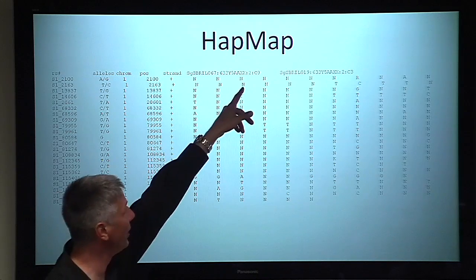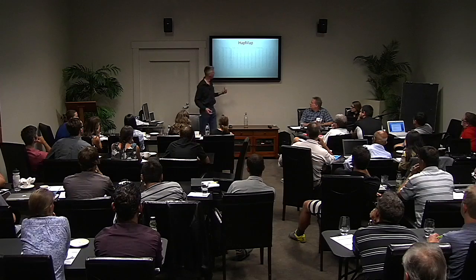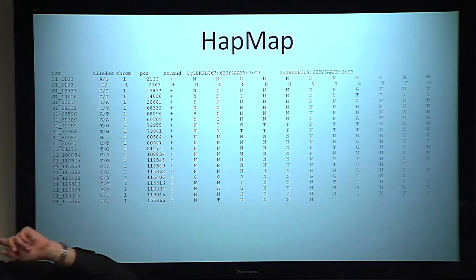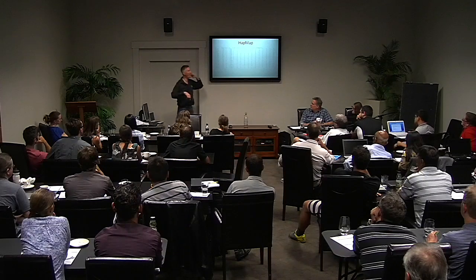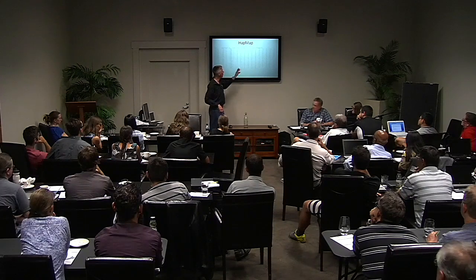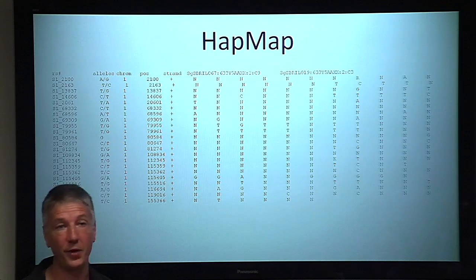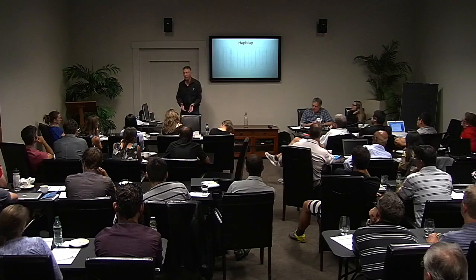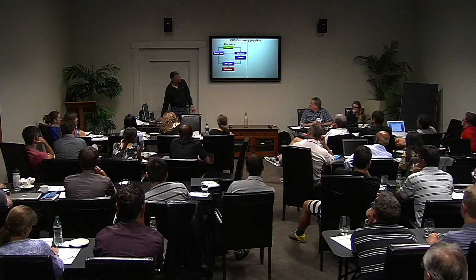And then a colon and 2. Anybody want to guess what the 2 stands for? The lane. Spot on. And then there's a colon and C9 in this case. Plate position. And that's used if there isn't a library prep ID. If there is a library prep ID, that shows up in the name too. And of course, you're holding on to all this information for diagnostics later, right? You might want to be able to easily go back and figure out where this sample came from. Okay, does that make sense to everybody? Okay.